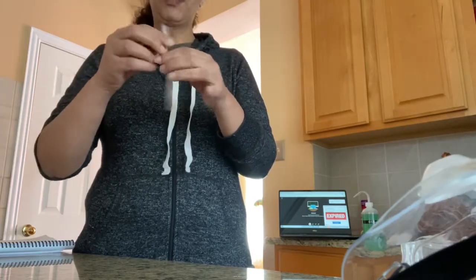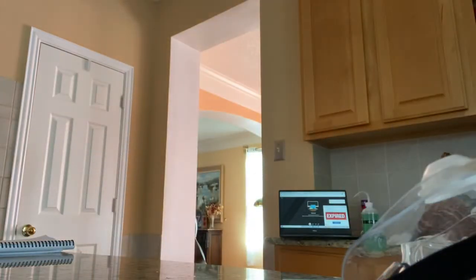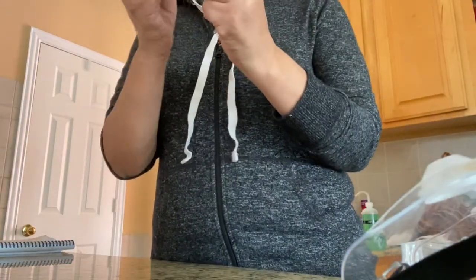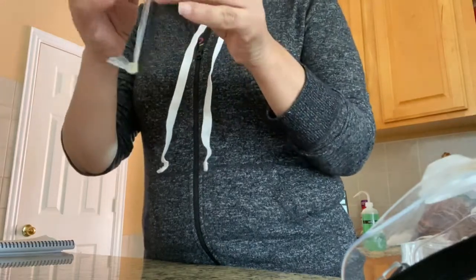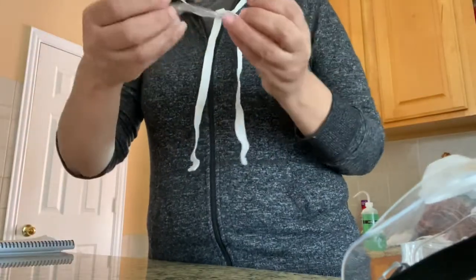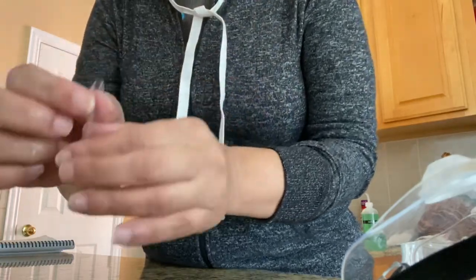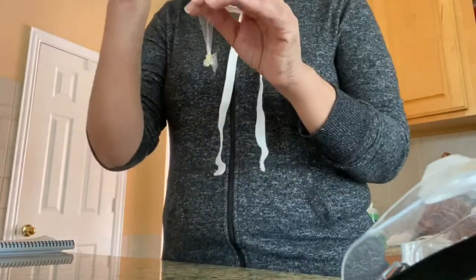I'm sure that I did it very well because I don't want any leaking, with my rubber bands. Tie it very well and then open it. And the way you open it, you just use a little water in your hand and rub it like that, and you will open it. So it forms like a sack, and inside of it, we are going to put, with our transfer pipette, 10 milliliters of starch.